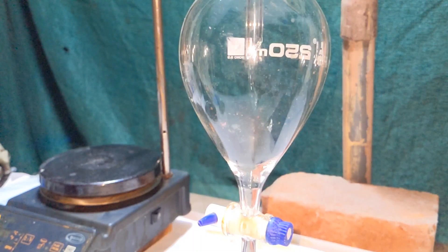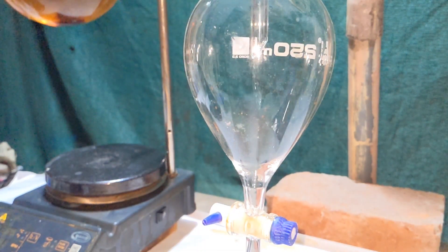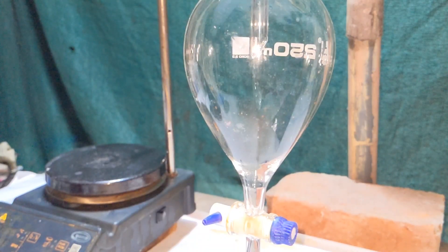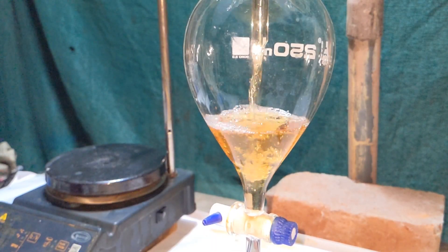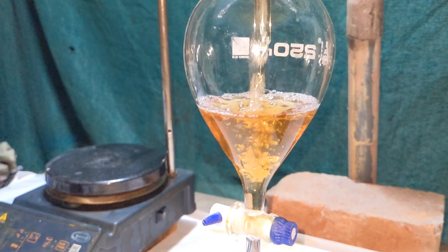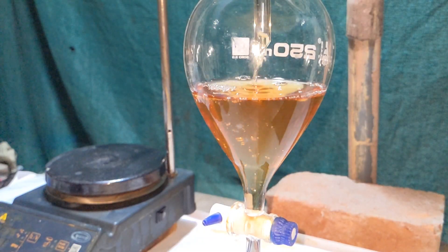The next procedure involves separation and purification of the two products. For that, a 250 ml separatory funnel was clamped on a stand and the contents of the round bottom flask were added to it using a funnel. Now we will extract the benzyl alcohol from it using diethyl ether.